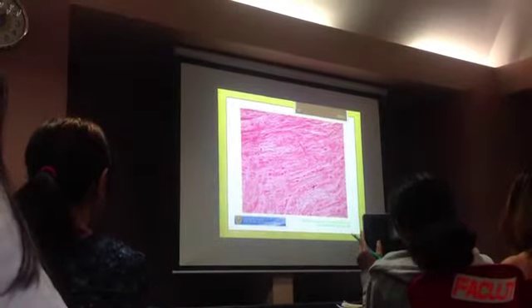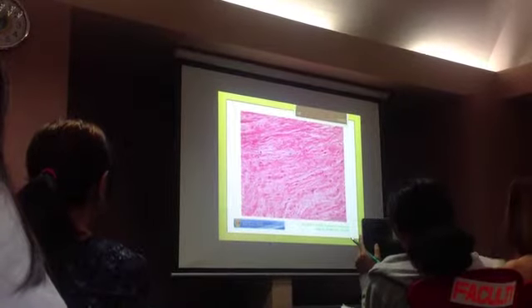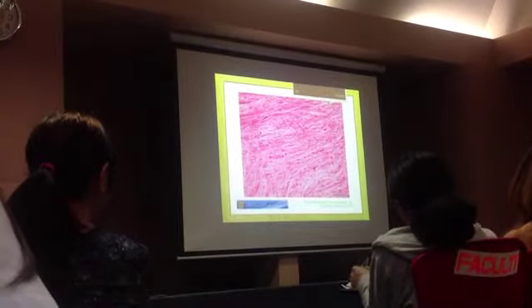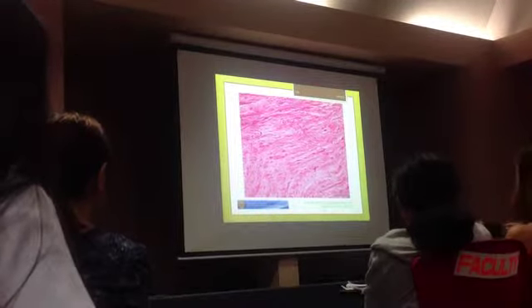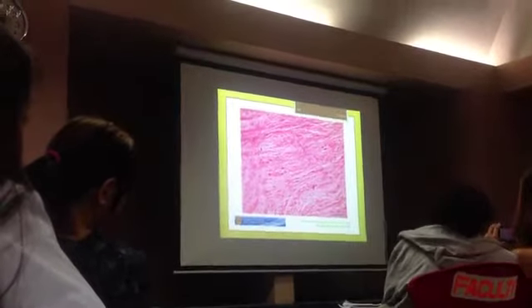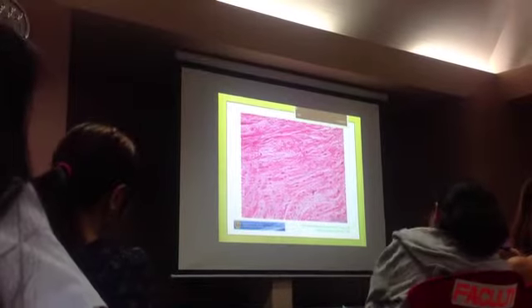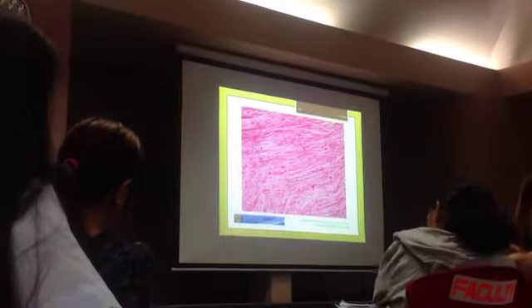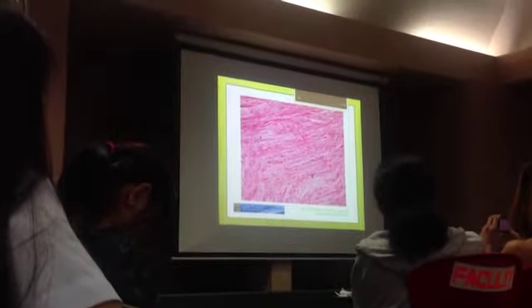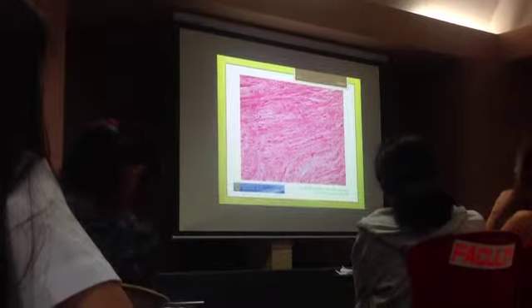So these slides, these microslides, are not arranged chronologically. It is randomly arranged, so it will simulate what will be in your practical exam. In the practical exam, we will not group all the epithelium together, all the connective tissue together. They are isolated, spread apart.